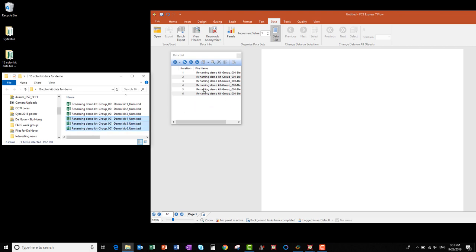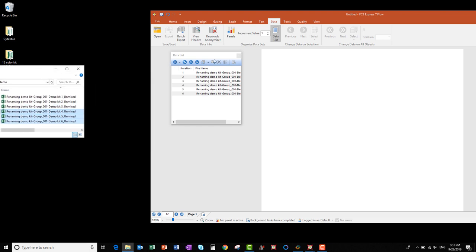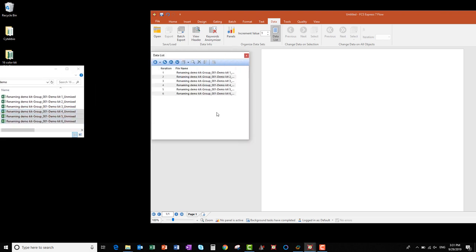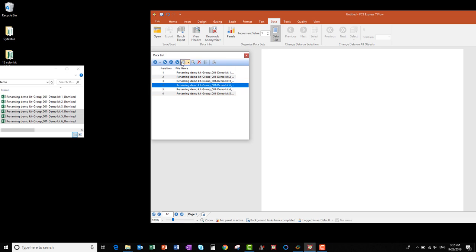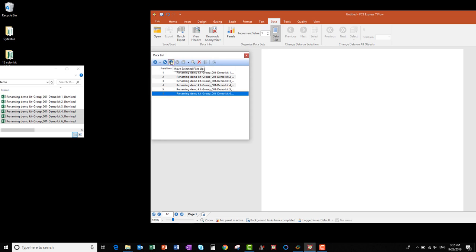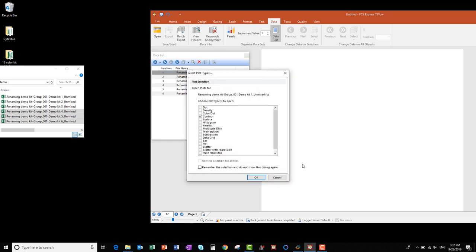If you want to change the order of the files in the Data List, you can either click and drag the file up and down in the list to move it, or use the up and down arrows at the top of the Data List menu to move the file up and down. To start creating our analysis layout, click and drag the first file in the Data List into the empty layout.